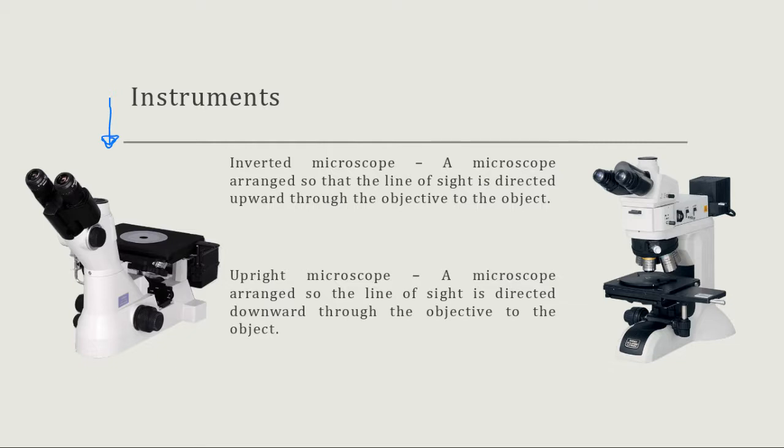When it's face down, because you've polished it, it will have a parallel surface that is pretty much perpendicular to that light that's coming through the stage. So you will have the best reflectivity.